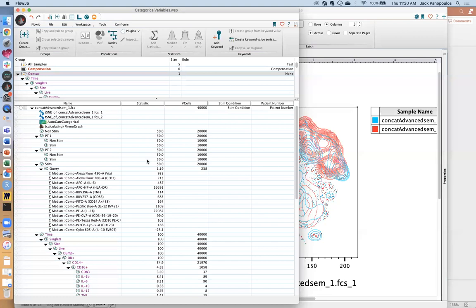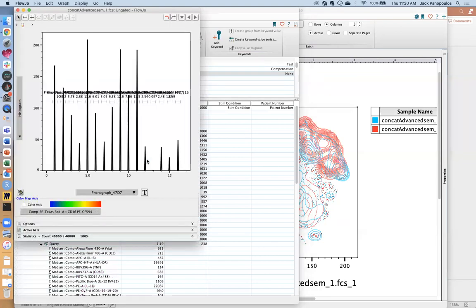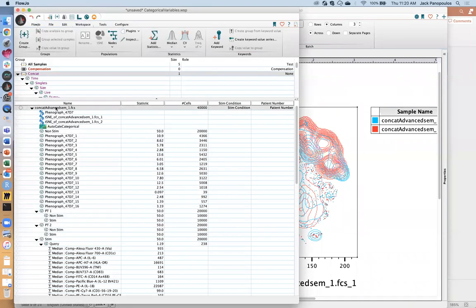And maybe what we'll do here is run a couple of different algorithms and see how well they cluster the data, or how they compare to one another. The primary thing I want to get to is, again, how can we compare categorical results or categorical variables in cluster space, right? Give me a second here. Phenograph finished.